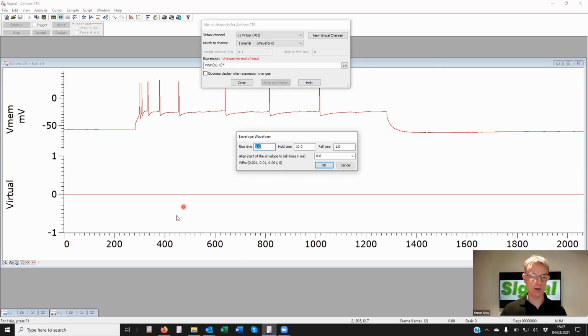So a rise time of, say, 200 milliseconds, a hold time of, let's hold that for 1600 milliseconds, and a fall time of 200 milliseconds.